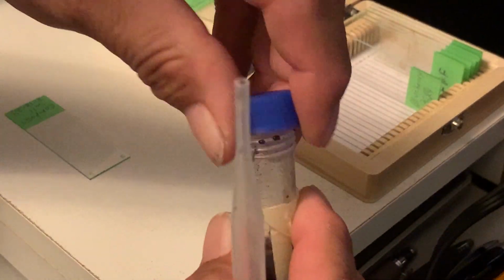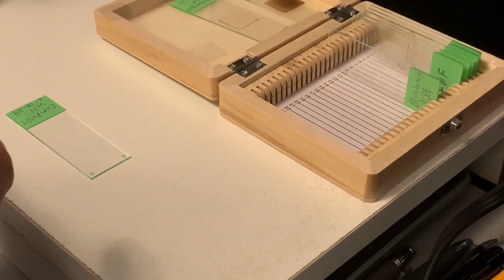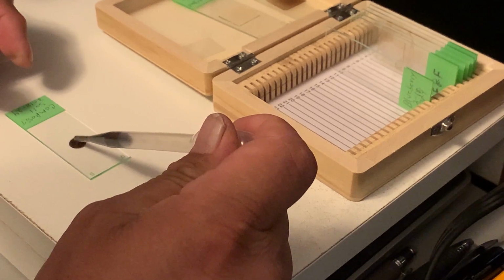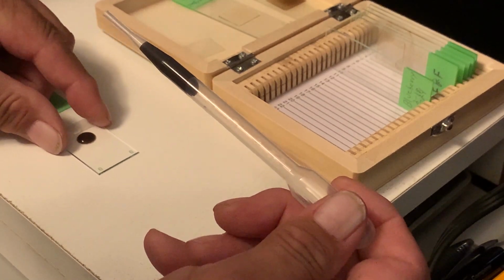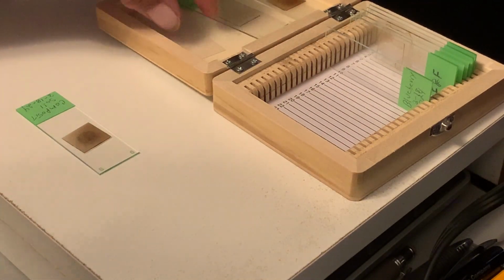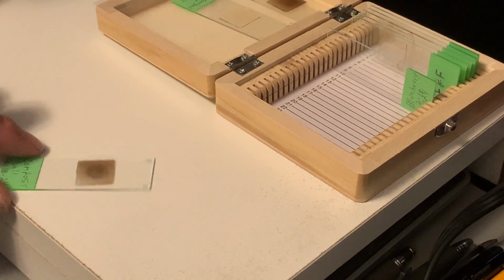Okay, you guys excited? I am. Don't know what we're gonna see. All right, let's take a sample. Set that over here. I got a cover glass and now a little drop. Basically, you hold a cover glass at a 45 degree and then just drop it. Alright, so there you go. We got successful. Okay, you can see how it's nice and spread.